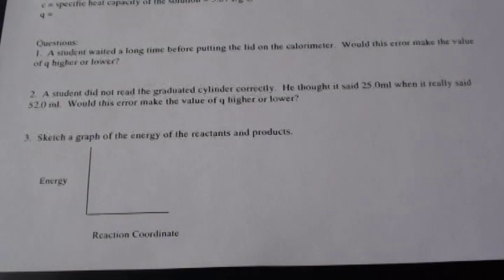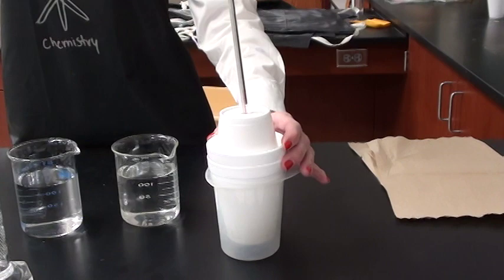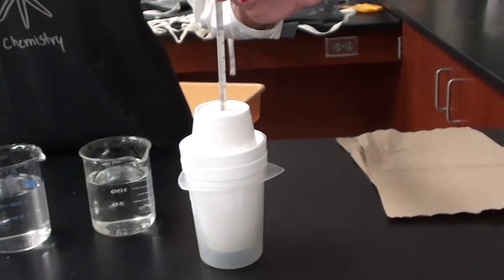This is the coffee cup calorimeter, and it's designed to keep heat in. This is the thermometer that will record the temperature.